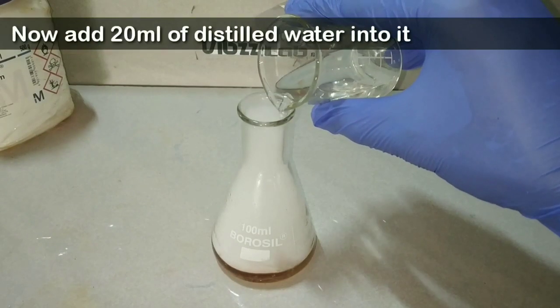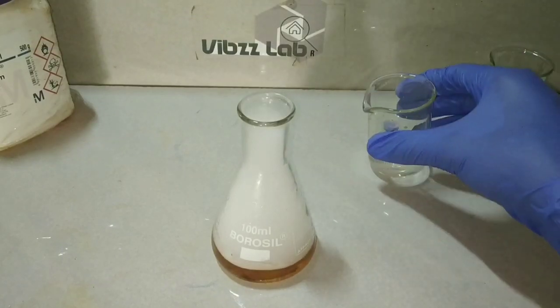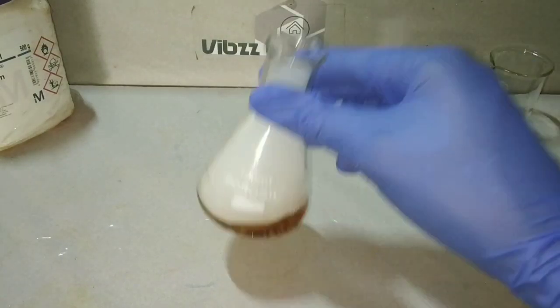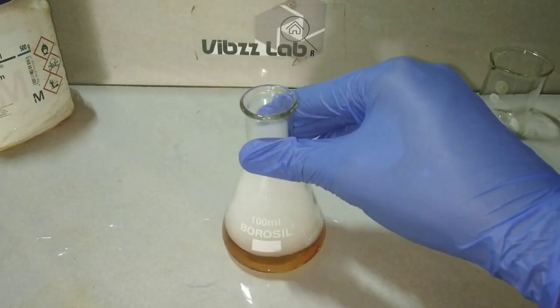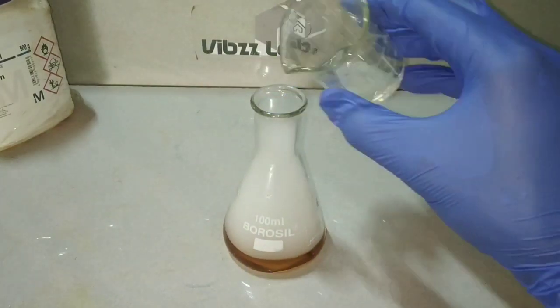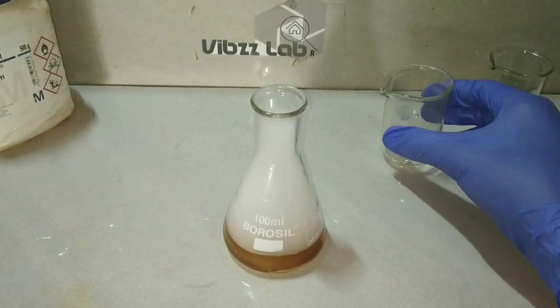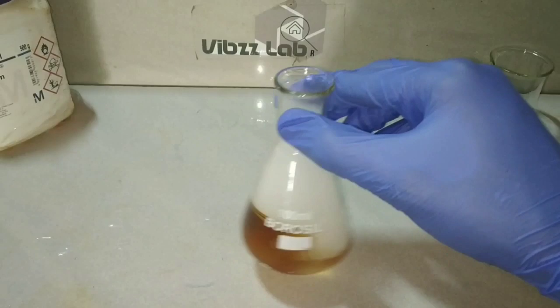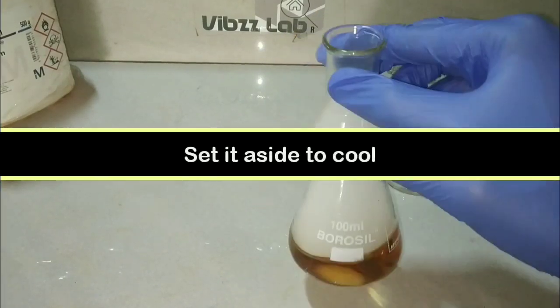We add 20 ml of distilled water and mix it well to make the solution homogeneous. After mixing, we keep it in an ice bath to cool to around 0 to 5 degrees Celsius.